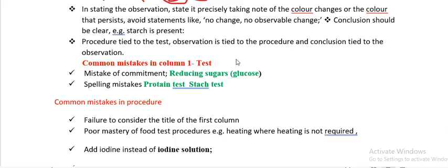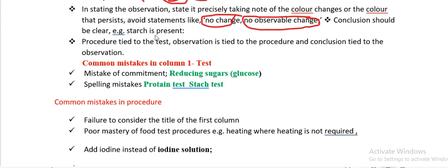When stating the observation, be precise and take note of colour changes or the colour that persists. Avoid statements like 'no change' or 'no observable change' — these are wrong. The only acceptable phrase is 'no colour change.' You should also write the final colour to avoid such mistakes. Conclusions should be clear, e.g., 'starch present.' It is wrong to say 'starch is not present' — just say 'starch absent.'